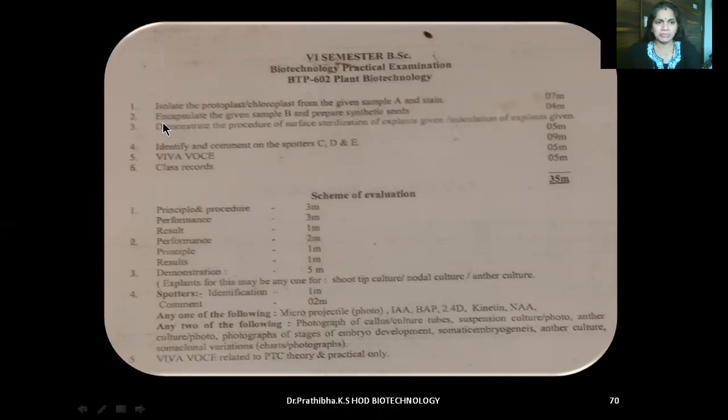Then question number 2: Encapsulate the given sample B and prepare synthetic seeds. This carries 4 marks. Performance 2 marks, principle 1 mark, result 1 mark.